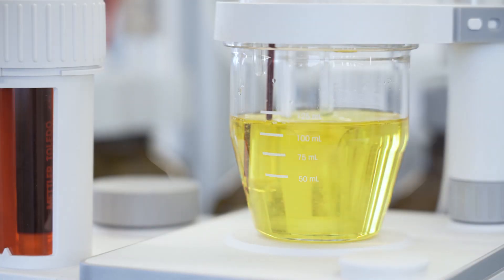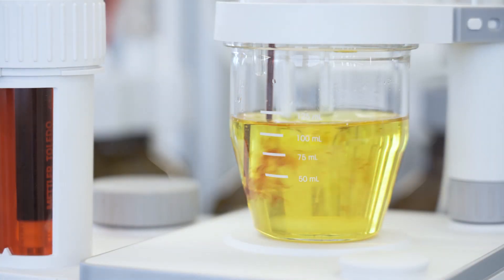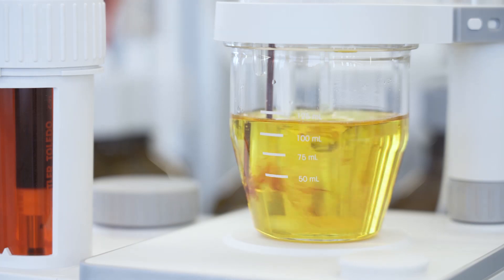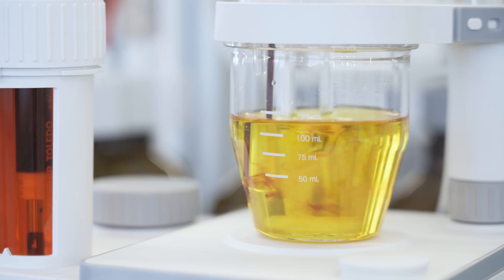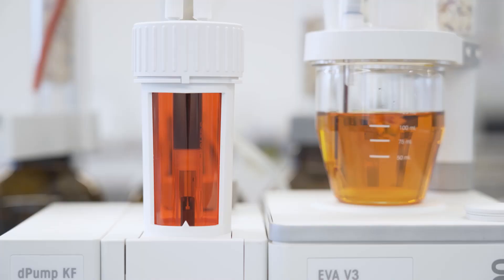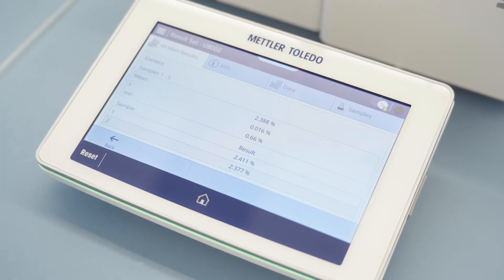The advanced algorithm predicts the exact amount of titrant needed to accelerate the reaction, while ensuring consistent reagent levels throughout the process. With a fast response digital sensor and precise drive dispensing unit featuring a resolution of 120,000 steps, the EVA titrator delivers very rapid and dependable results every time.